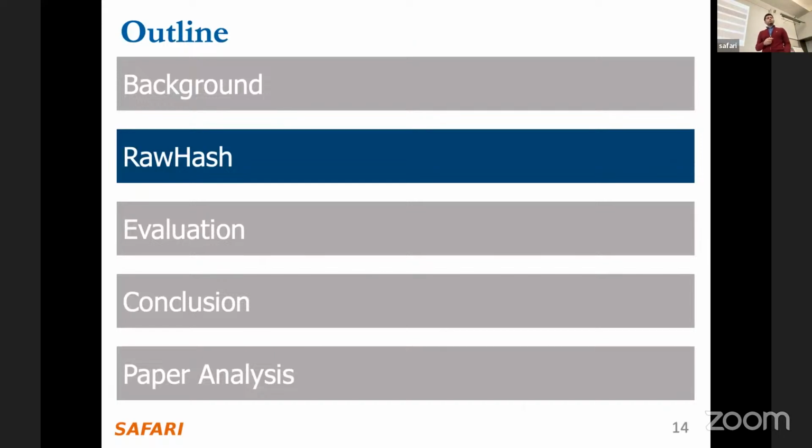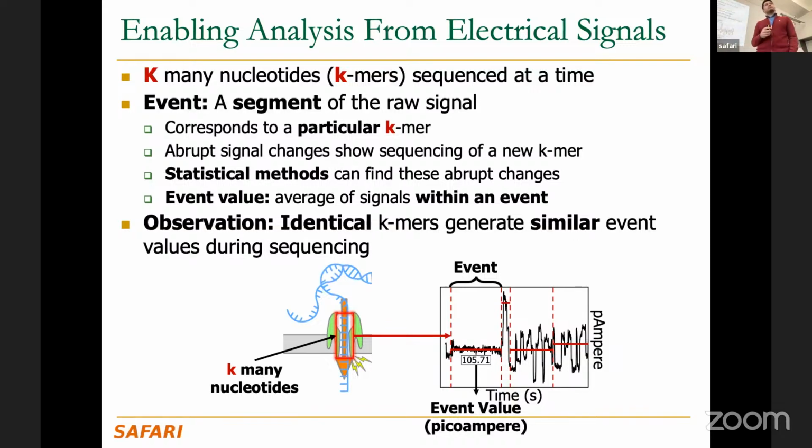Go ahead. So the entire genome, like the 6 letters in this example, could be derived from just this one value? Almost, yes. There are some normalization steps and some outlier detection steps, but you can make a pretty good guess what sort of K-mer you might have there, depending on this value. Although it's not always 100% accurate. Yeah. It's accurate enough. I was just trying to answer in principle. Yeah.